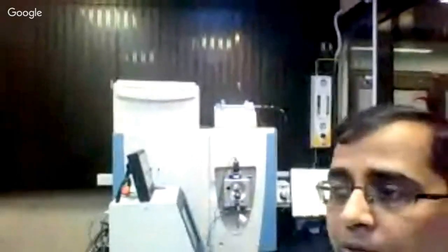We have another instrument here, which we can see from the image, the Q Exactive instrument, another type of Orbitrap technology. It is a hybrid technology, not the tribrid you have seen before. It also offers good resolution, almost 125,000, as high as what you get in the Orbitrap Fusion technology we just talked about. But you need to appreciate that there are different types of mass spectrometers, and those configurations can be used for different applications.